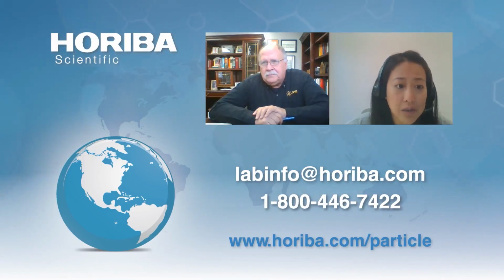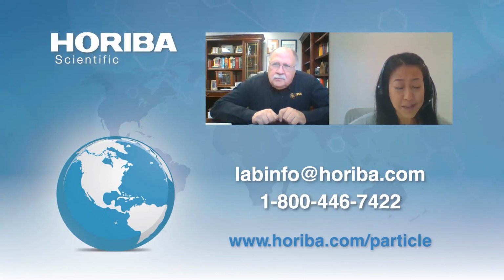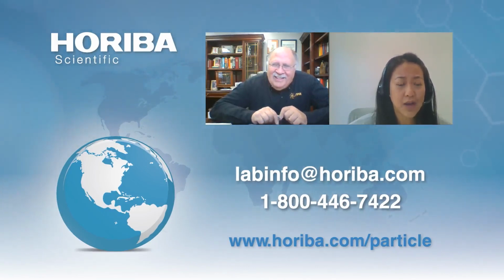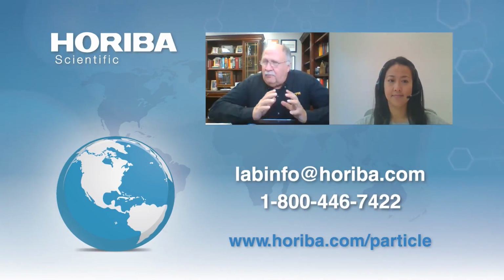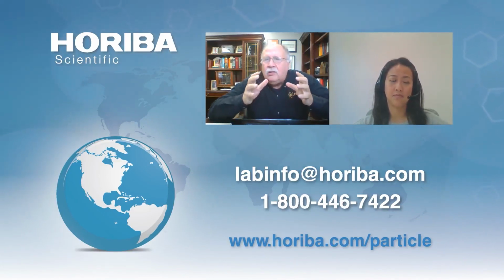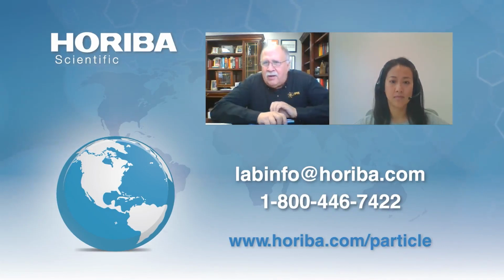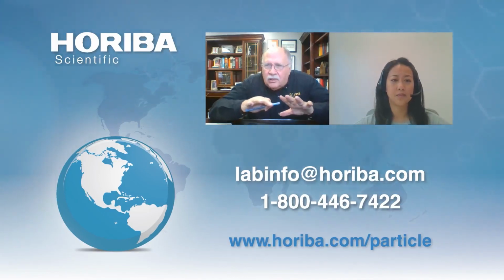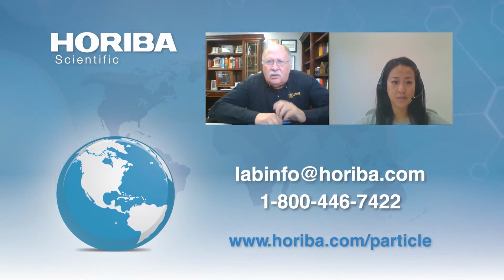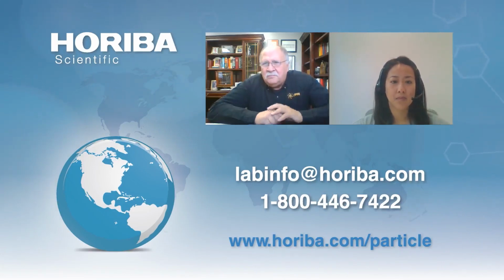Thank you very much. The next question: what is wet screen? We have a similar issue where some large particles in the sample don't show up in laser diffraction. So what we do in a case like this is you take a volume of material. For us, it was 1 pound of material. We slurry it up in water, and you can screen at a very fine size, a smaller size than you would normally use for dry screening. Now you screen, trying to get all the particles to go through, and at the end you can actually count the particles that stay on your screen. That's the way you do it. Make a slurry, screen it, keep adding water till everything's washed out other than the big particles, and then you can count them. Thank you.